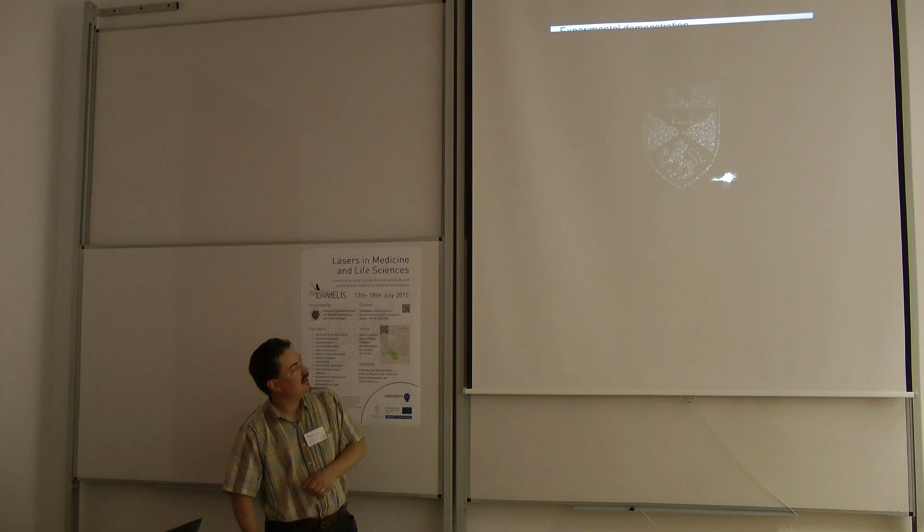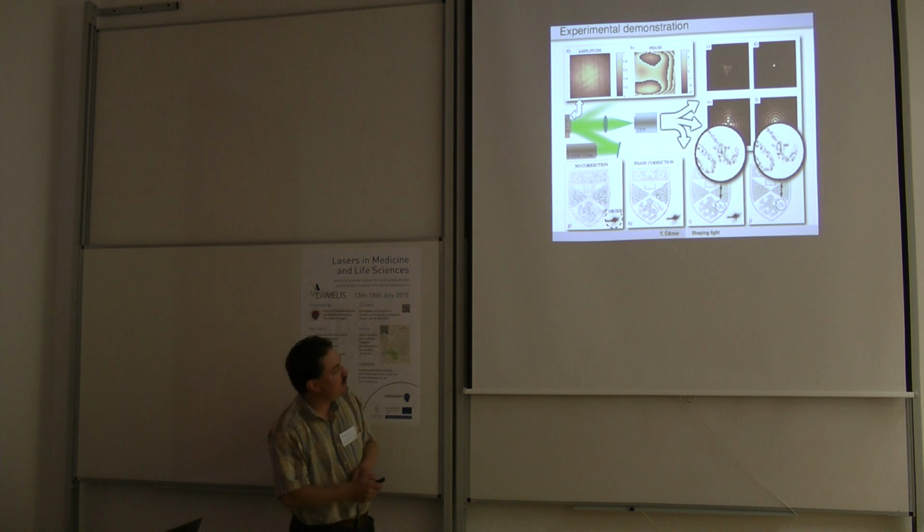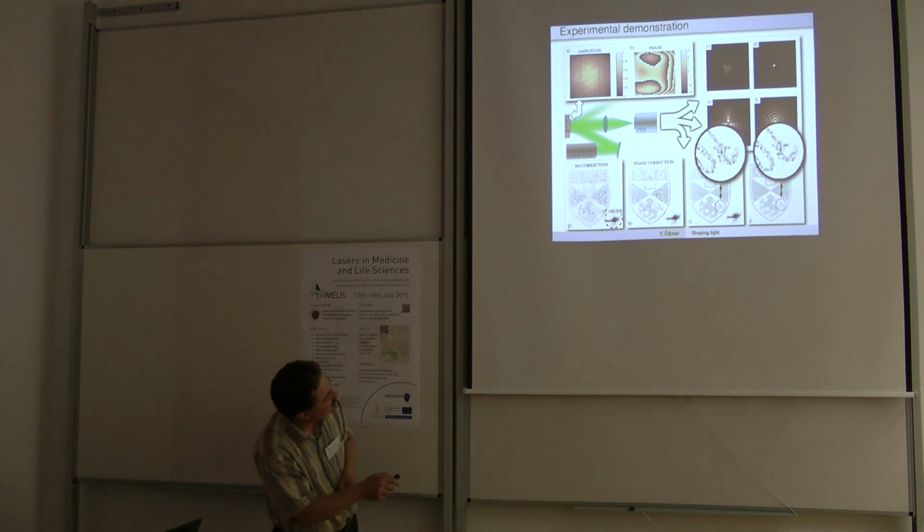So this is a solution where I use what we call the phase-only correction, when I apply the phase correction only. And this is when I actually also use the information of the amplitude. So I got something very, very good. And if you compare the details between the simulation, what I should have got, and the actual reality, you can see that they are practically identical.